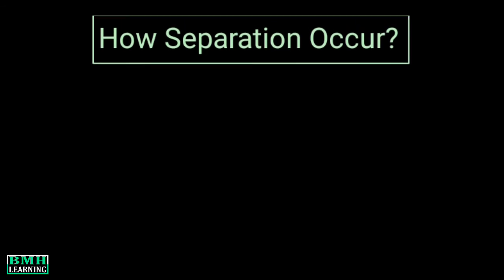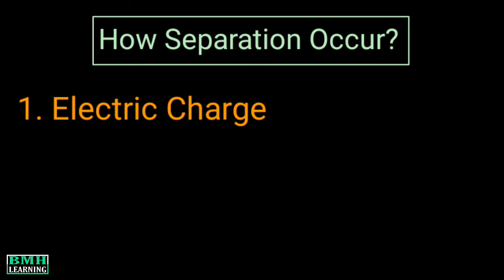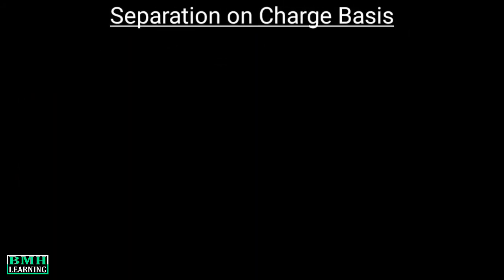Now the important concept here is how the separation of the particles occurs. So we will consider two important aspects. First is electric charge and the second one is molecular size. Let's first talk about how particles are separated on the basis of charge.